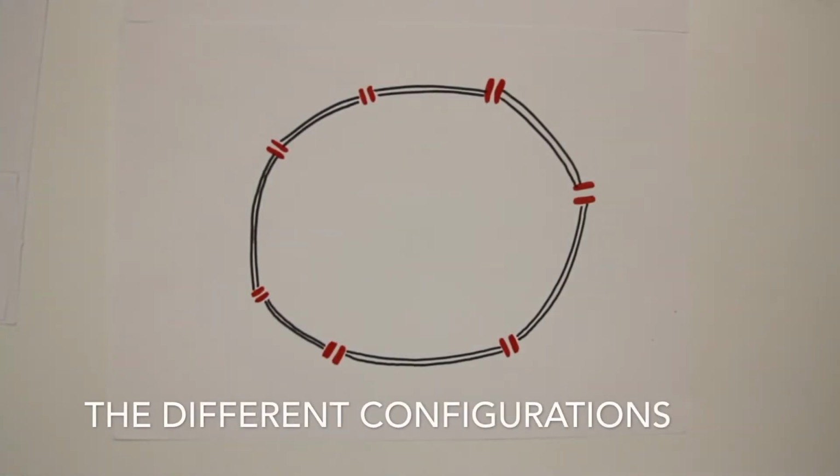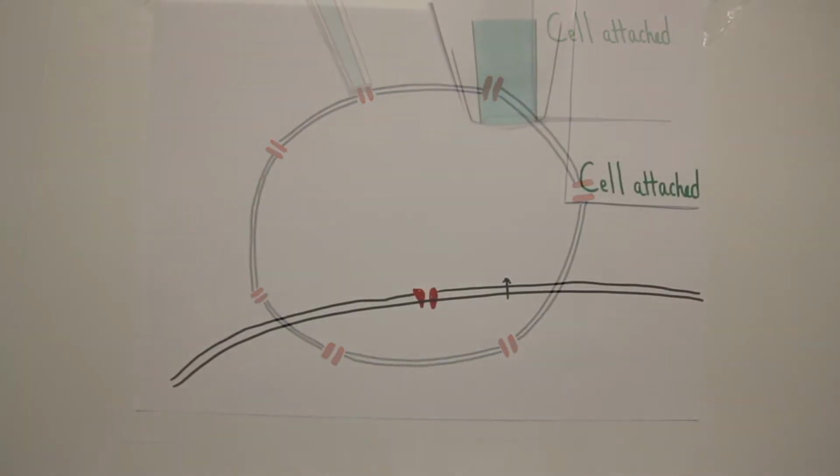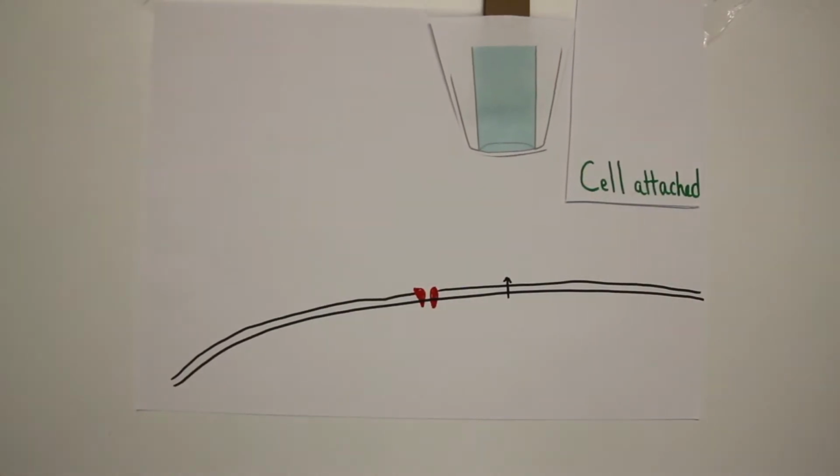During the cell-attached configuration, the recording pipette is sealed onto the cell. This configuration allows to control the patch membrane potential. Thanks to this conformation, the cell is not disrupted and its normal intracellular environment is maintained. But the exact value of the resting potential is unknown, and we need to measure it. This configuration measures microscopic current.